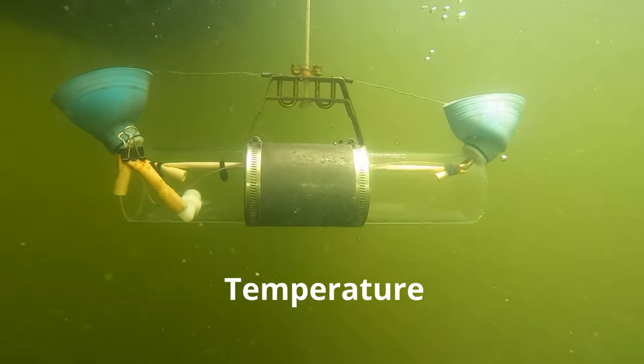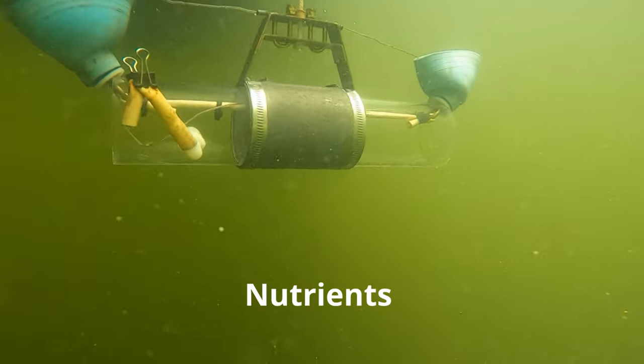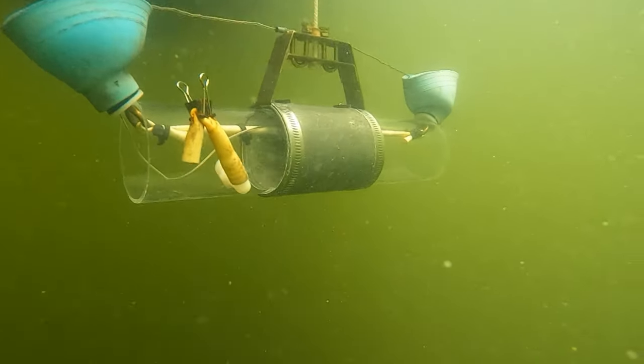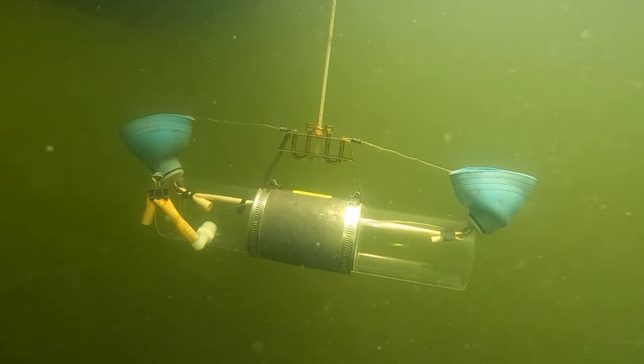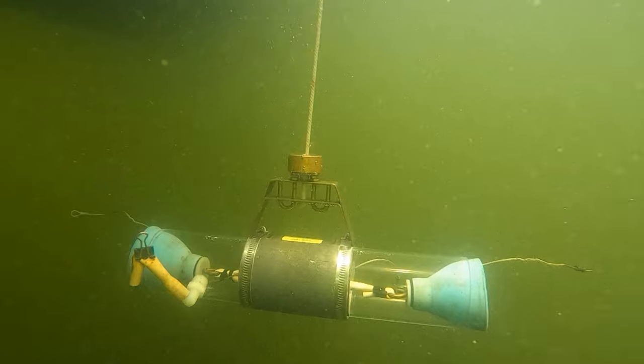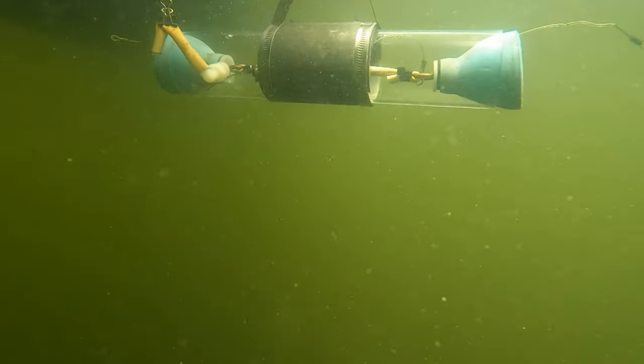As part of our comprehensive approach, we monitor various parameters like temperature, dissolved oxygen, nutrients, and contaminants. The Van Dorn water sampler allows us to collect precise samples from specific depths, providing a comprehensive picture of water quality variations within the water column.